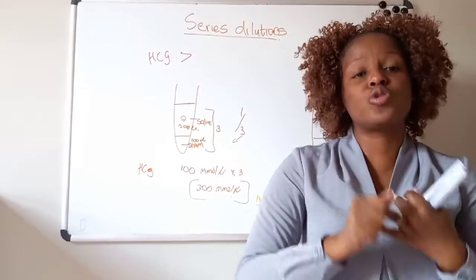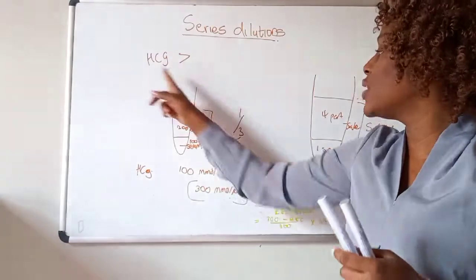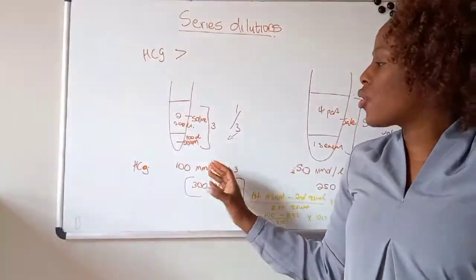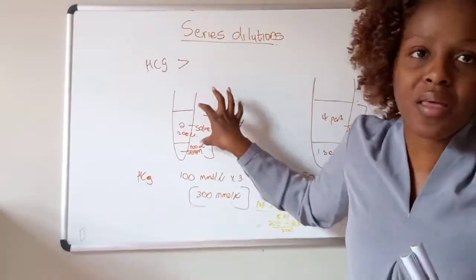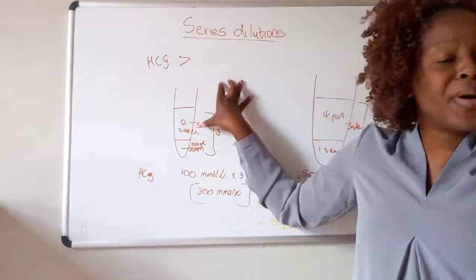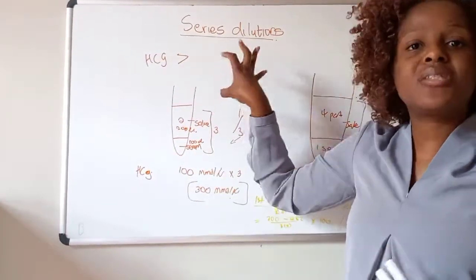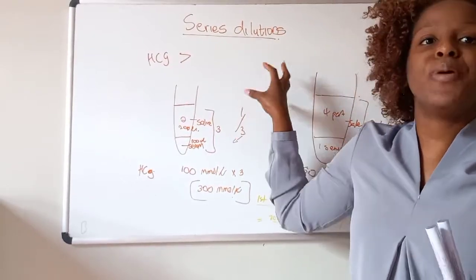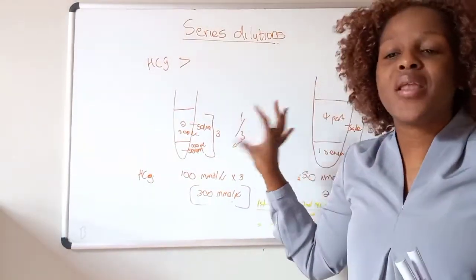And it's also important to do 2 dilutions, because if you only did, let's say, the 1 in 5 dilution, you get a result, you report it, how sure are you that you did not make any error in that tube? Because we are humans at the end of the day. If the pipette fell, or went out of calibration, it will also affect the volumes that you use. So it is important that you don't do 1 dilution, but you do 2 dilutions, basically to check yourself and rule out human error.